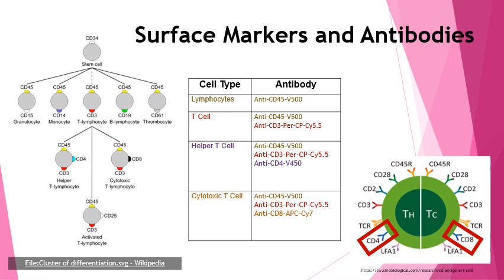So for example, in this slide, I gave the example of T cells, and specifically NHP CD markers. These CD markers are unique to different types of species. So what a CD marker is for a certain cell type on NHP might be different from canine or feline or rat and mouse, etc. So you just want to make sure that you are looking at the right CD markers for the species for which your panel is built.